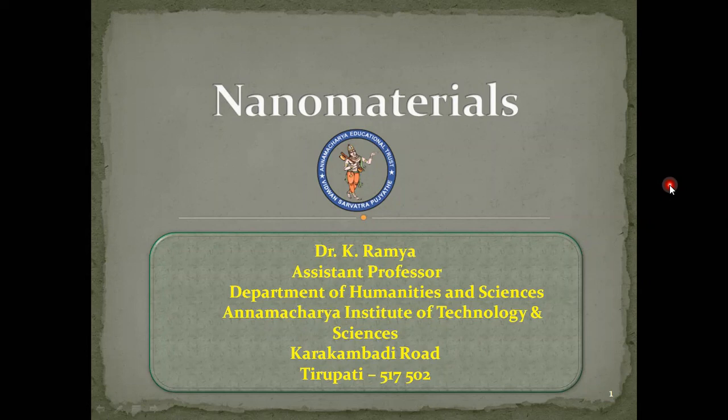In the present session, we are going to discuss the characterization techniques. So what are the characterization techniques? Characterization techniques exactly give the characteristics of the material we have prepared. That may be a thin film material, a nanomaterial, or a bulk sample. We are going to detect what the analysis is, so how far we have achieved our material, whether it is the material we have expected or not.